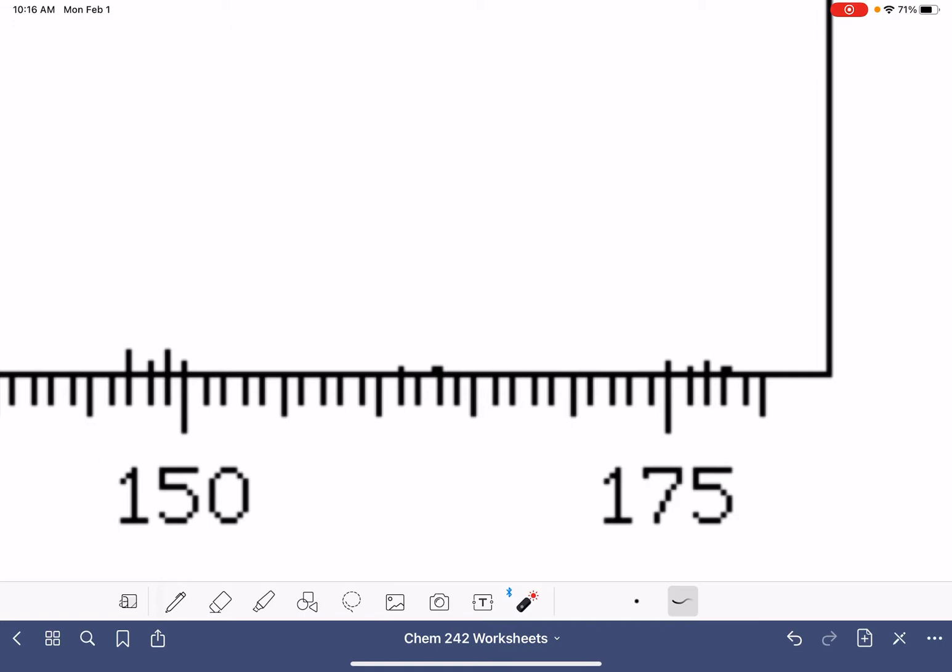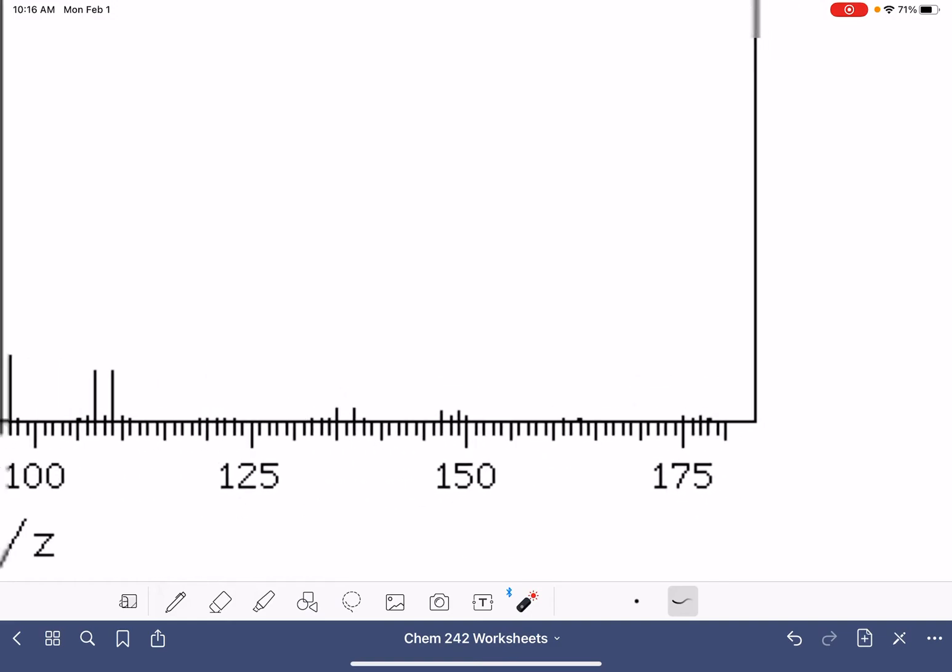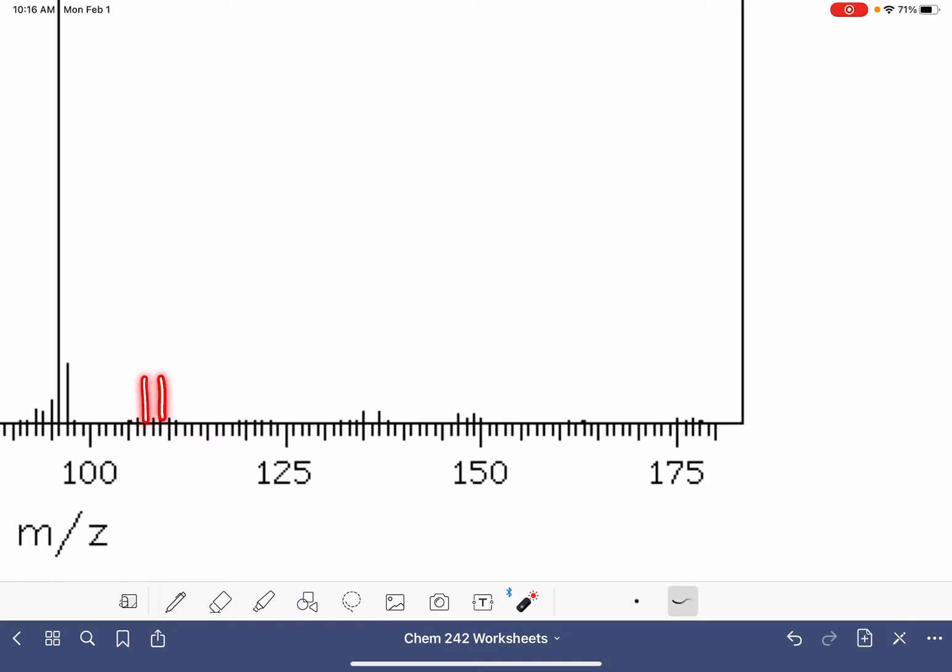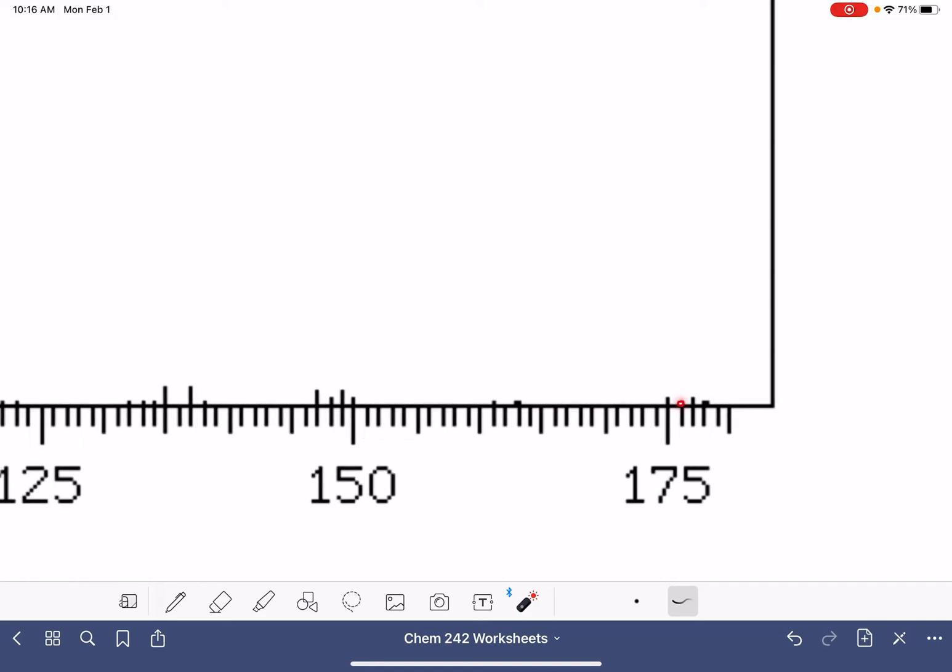Those peaks are so tiny, but there they are. This mass spec is actually really difficult to analyze because of how low intensity all of these peaks are. These are actually M plus two peaks. It's a little bit easier to see here and here, but we do have bromine present in this molecule. We have a peak and another peak that is two units higher and they are equal intensity.